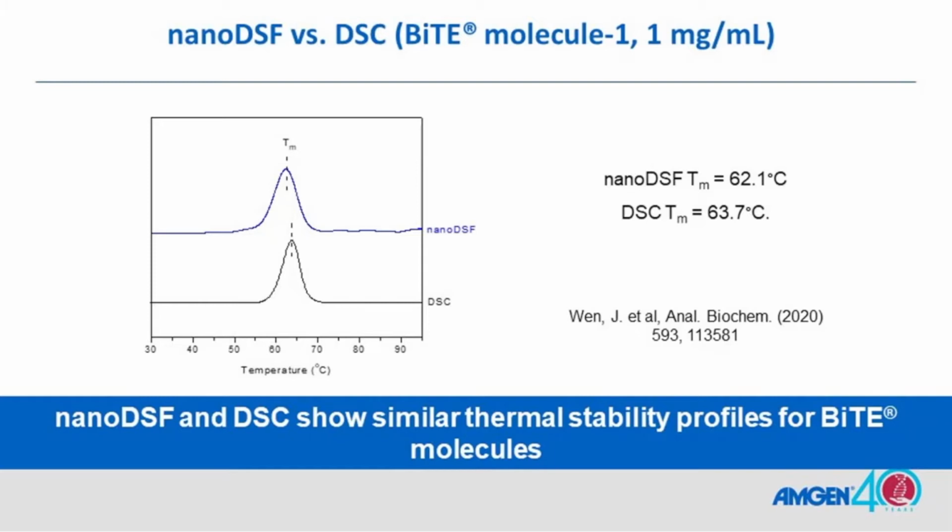In this figure, the blue trace is the nanoDSF profile. The black trace is the DSC profile. Here are the nanoDSF and DSC Tm values. From this figure, once again, you can see nanoDSF and DSC show similar thermostability profiles for biotherapeutic molecules.